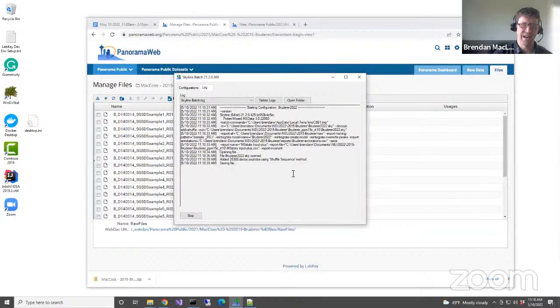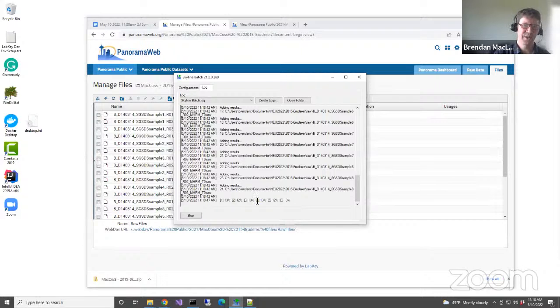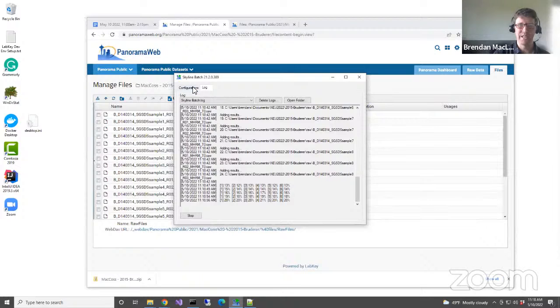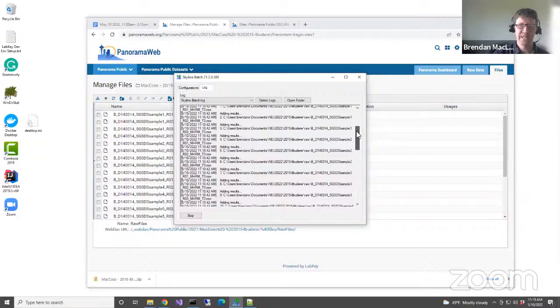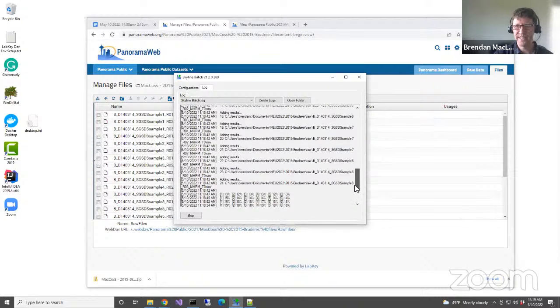It skipped the downloads, even though we said you could download, because it has recognized that we've got all the files. And here it's already doing the chromatogram extraction. You can see it's doing 6 files at a time, and it's going to march through this. I think on this computer, it does the full analysis of 24 files in about 20 minutes. And we can go back and look at that, and we can switch to the completely processed folder in a second. But you can see that it didn't do any file downloading because it found that all the files it needed were present.